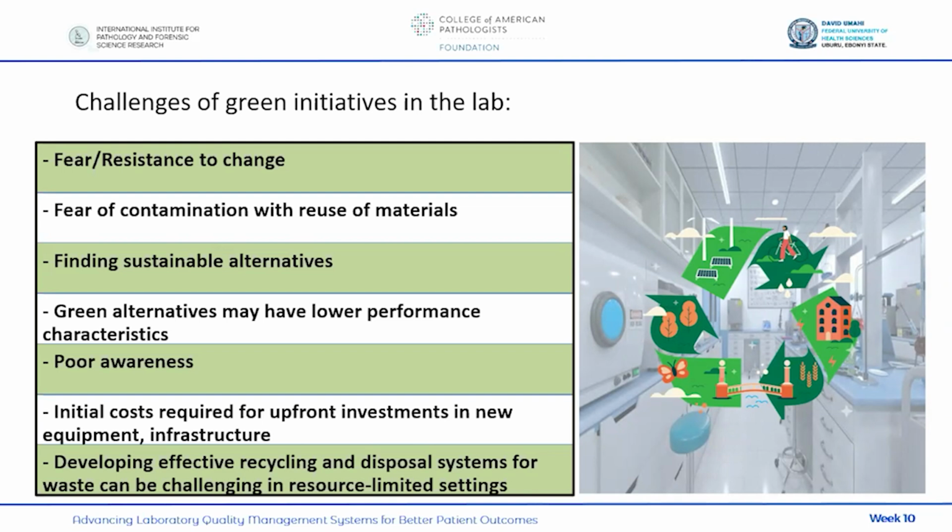Finding sustainable alternatives can also be a challenge, especially for us in the laboratory. Like there are talks about replacing hazardous chemicals with less hazardous chemicals. Okay, so now for us in the laboratories which use some standard SOPs, there are particular chemicals that you have to use in that SOP. So what the fear is, if you replace that with a less hazardous chemical, is it going to have the same results? Okay. So finding sustainable alternatives may also be a challenge.